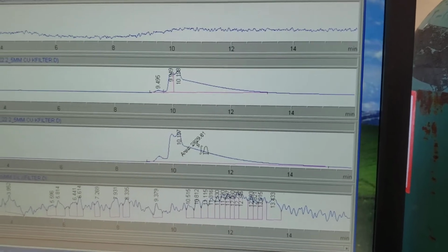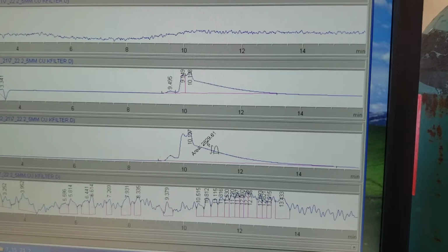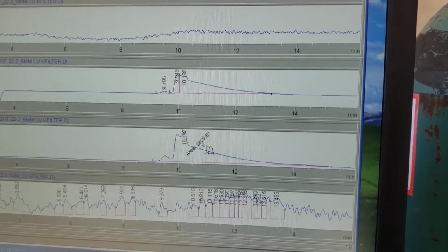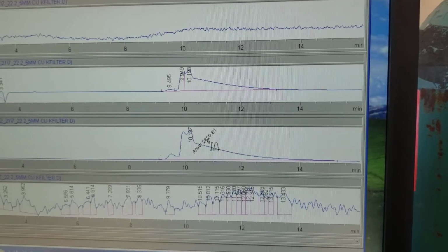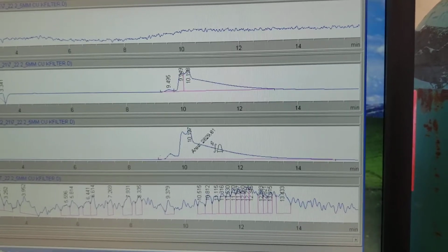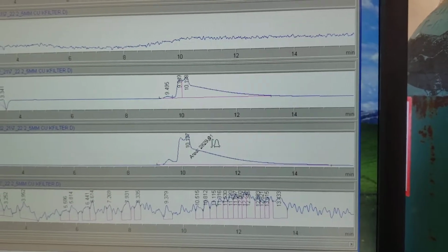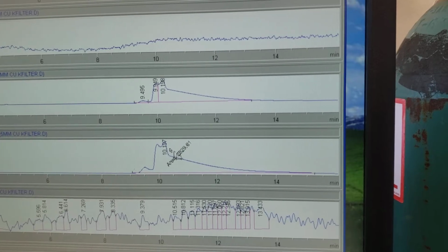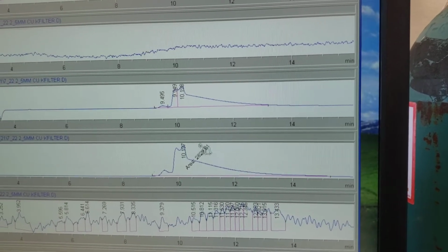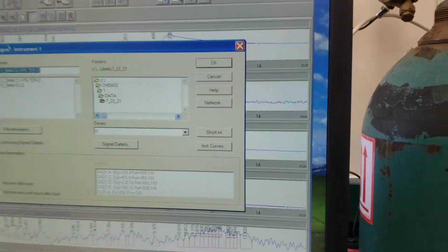But as you know, because of our previous experiments with different sizes of activated carbon, this activated carbon that's in this filter might not absorb the EDTA really well, and so we might find that, I would say that this is a significant decrease from 35 to 28. 35, that was the other one, right?